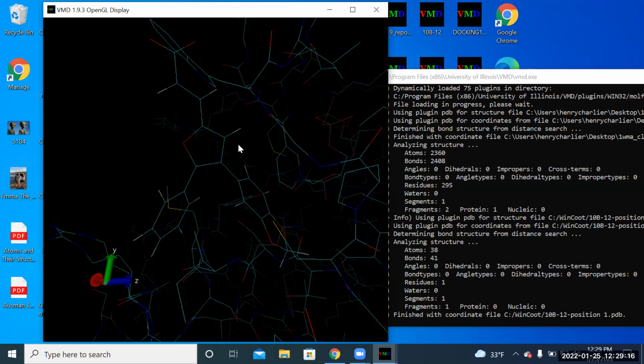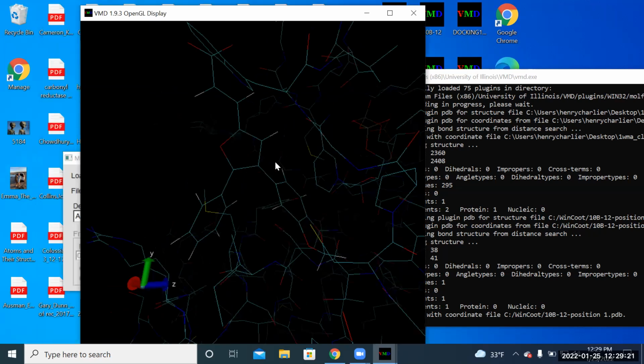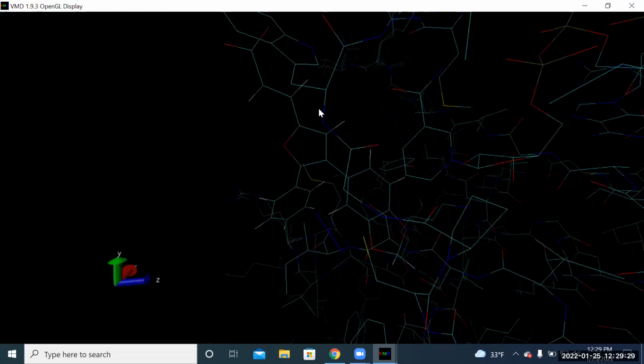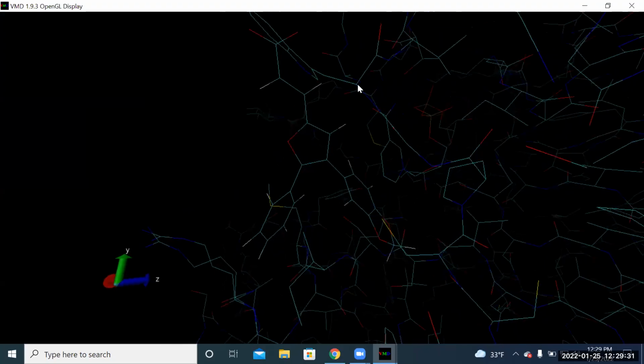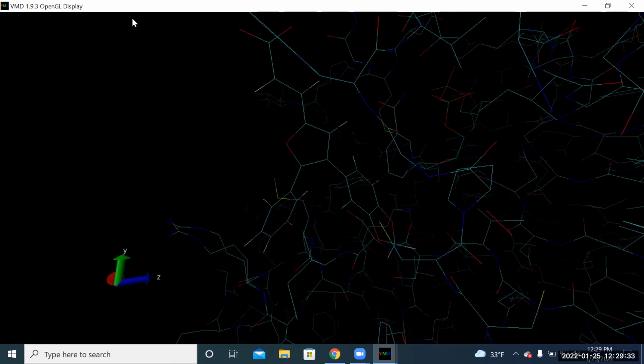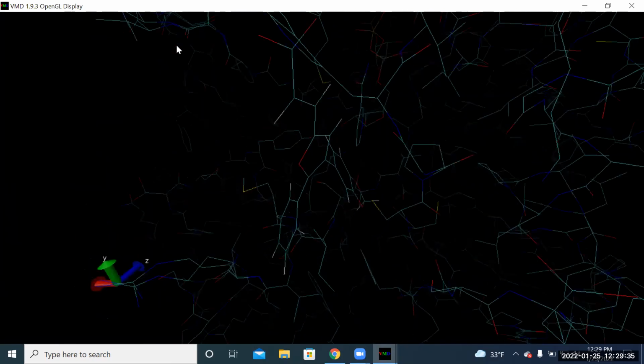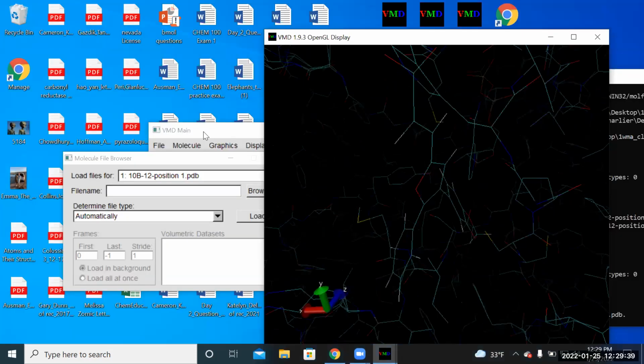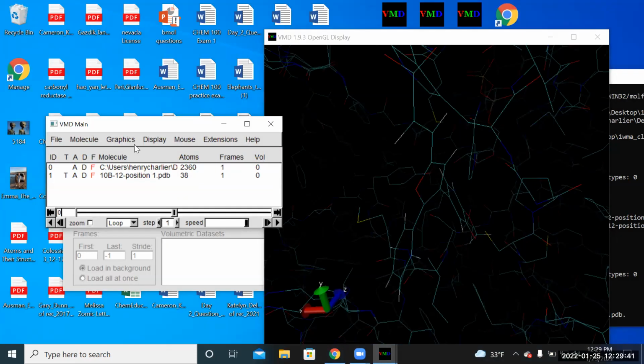Another cute little trick I use in VMD helps me notice if I have a problem. It's just a quick view, not the best way. I still think measuring all the distances, everything that's close, and making sure nothing's too close is the better way. But this does work out pretty good, and I'll show you. It's just a quick and dirty way of seeing things.